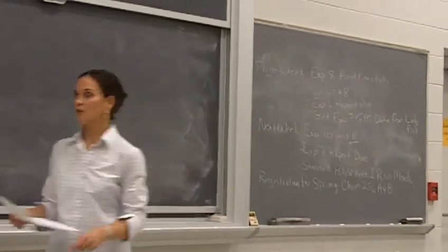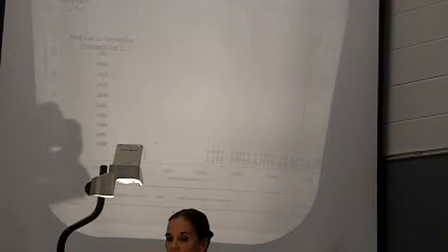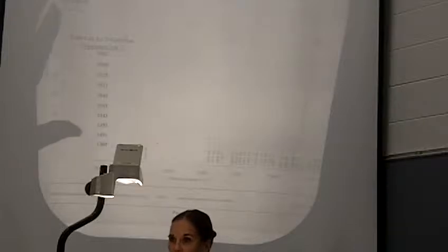All right. Let me show you the IR from polystyrene, and then we'll get into talking about experiment 8. So this is what I have posted on Moodle for you to compare your polystyrene products to. You do not need to print a copy. Save some trees. Don't print a copy, okay? What you need for comparison is this peak list right here, and then looking at the overall IR, how does it compare to what your IR spectrum looks like, okay?